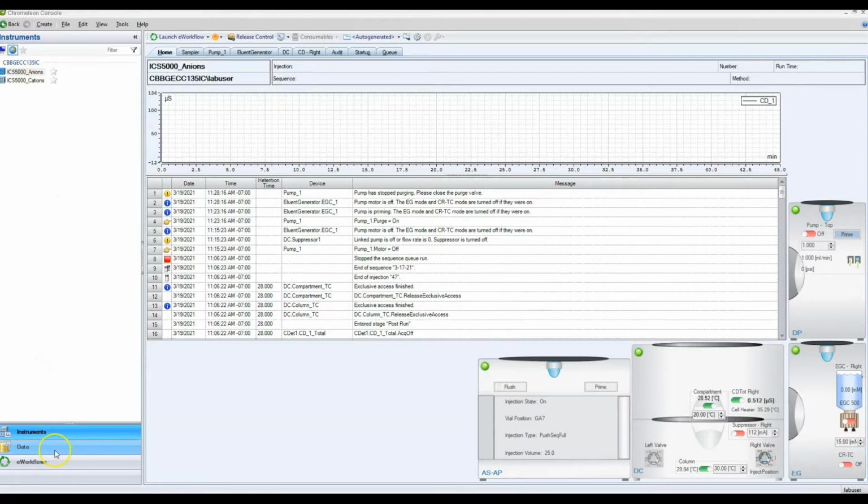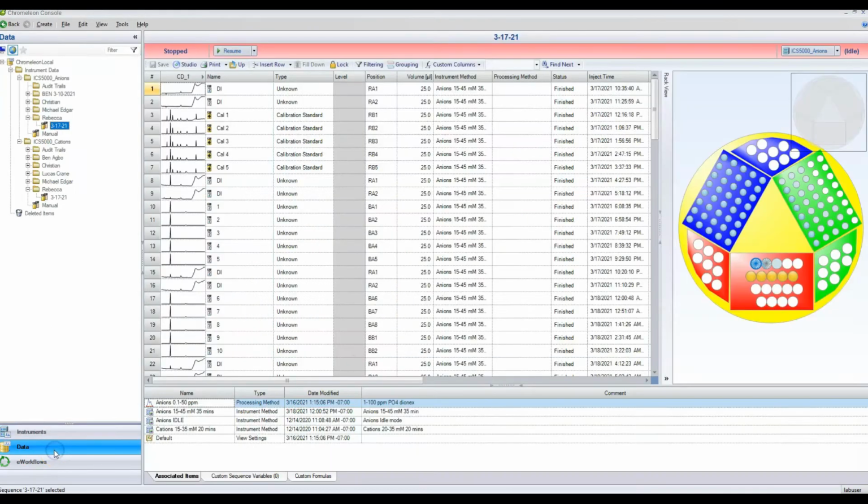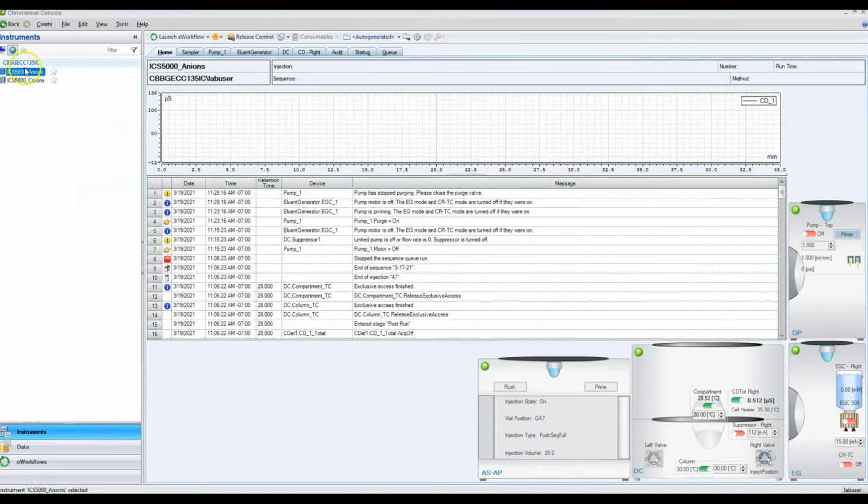The Data tab, this is where we set up our sample runs. It's where we tell the instrument, hey, this is where I put all my samples, and this is the type of analysis that I want you to do on it. So we will be messing with that after we get the instrument ready to run. And we need to set up both the anions and cations side.